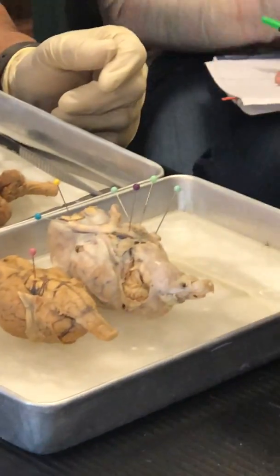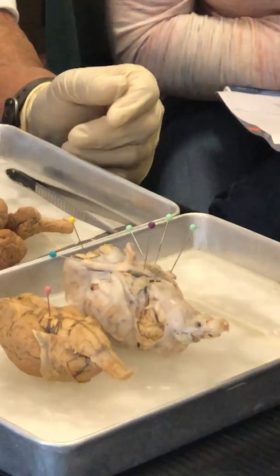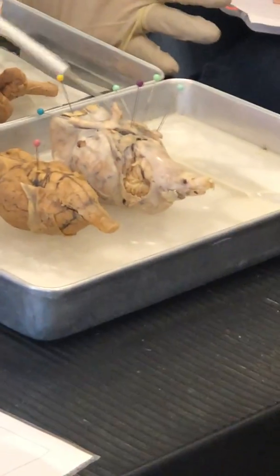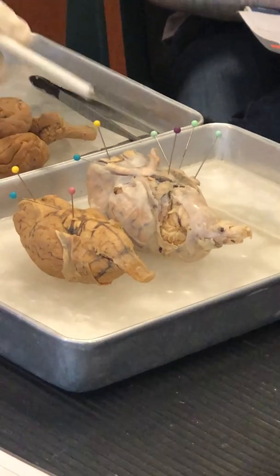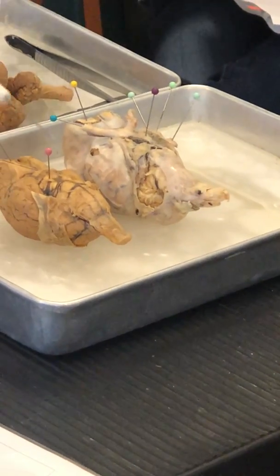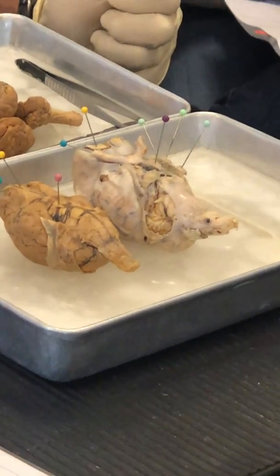Trigeminal. Now notice there, the pituitary gland is gone. And many times what happens is when we peel the dura mater off, chances are that the pituitary gland gets pulled off and the trigeminal nerve gets pulled off. Not all the time, but most of it.